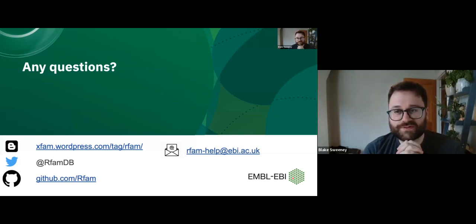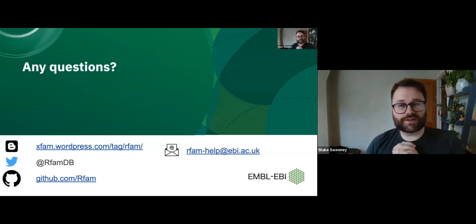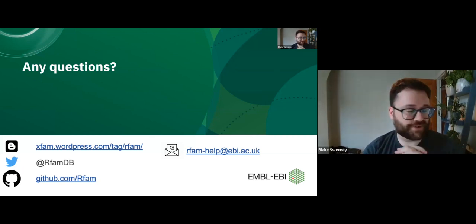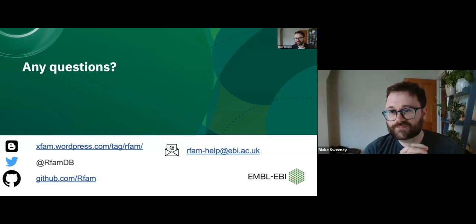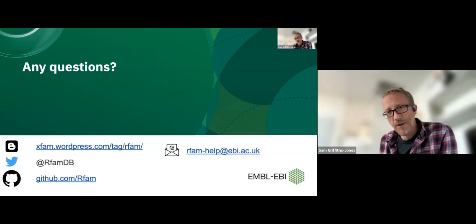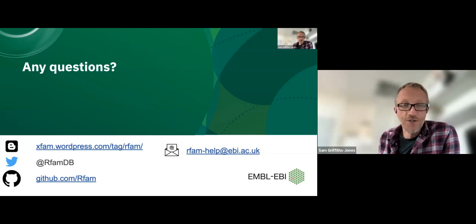Maybe Sam might know a bit more about that. I think he's done some of it, but I think the answer might be: do you want the overall statistics, or do you want a particular match, exactly what you're trying to get? We might change that. Unless Sam has anything out there. I'm not sure I entirely understand, but I think mapping information onto secondary structures is a really useful way of showing these things.